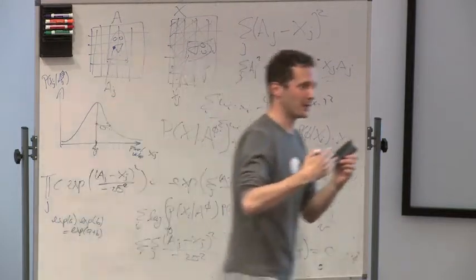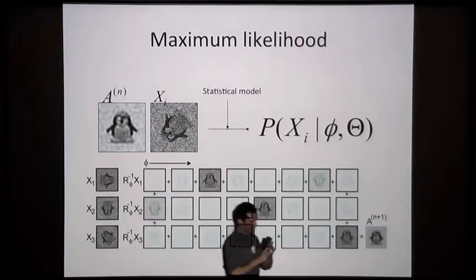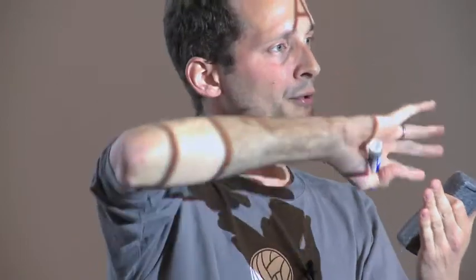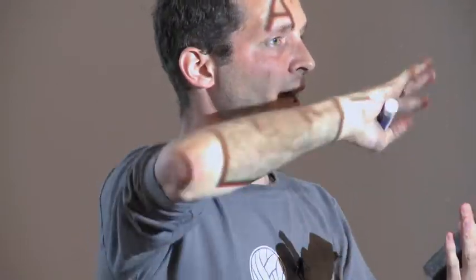So what we're doing now, rather than in the maximum cross-correlation approach, where we decided which was the best orientation for every particle, then did the average, and then iterated round, is calculating a probability for every one of the orientations. For every particle, the particle is added to the average as a weighted average according to those probabilities. To illustrate that, I've put on this picture.